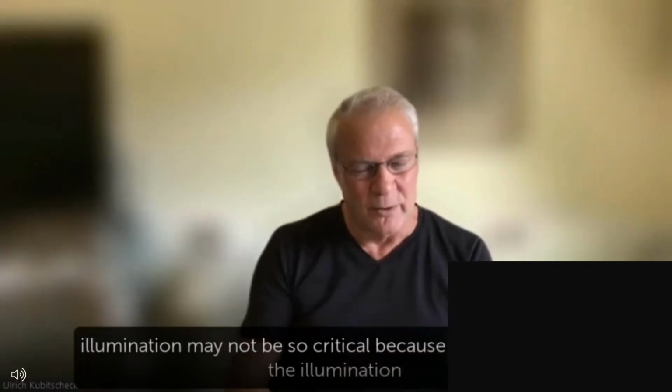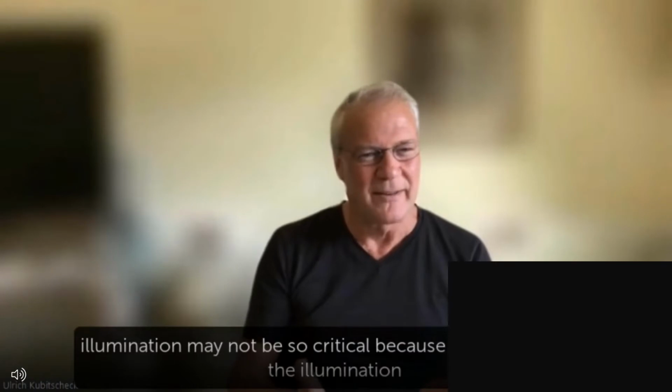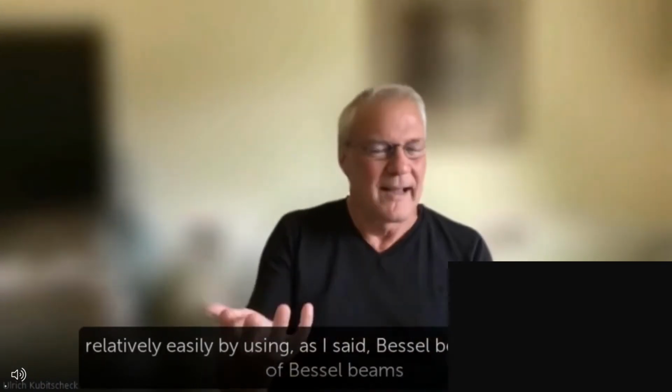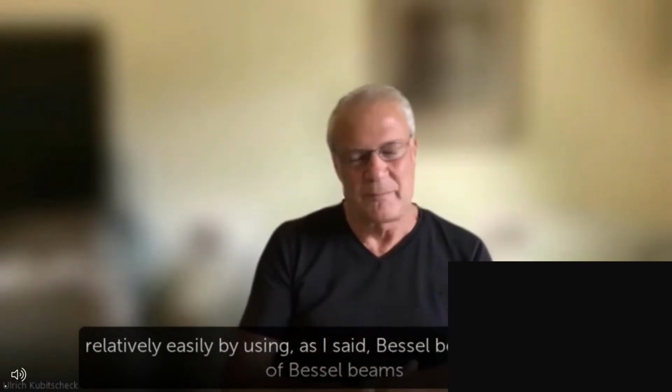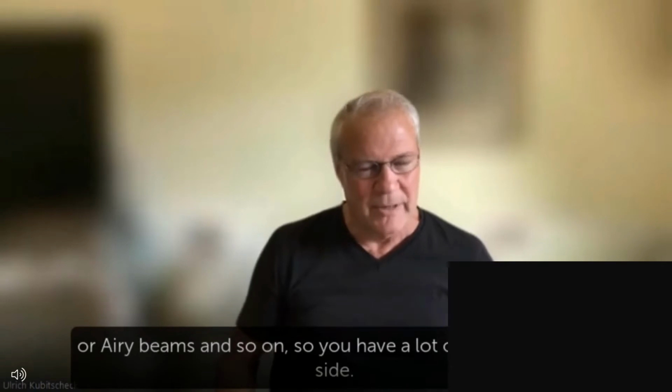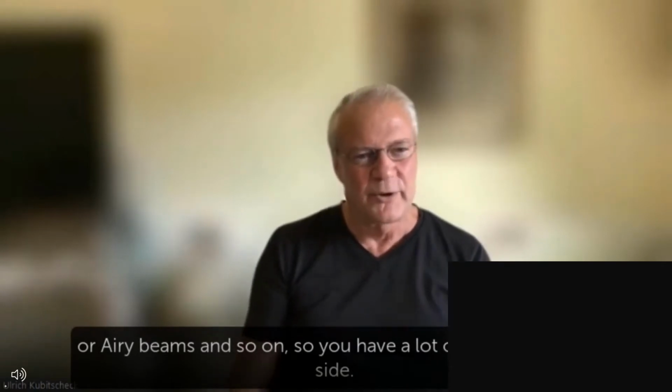Illumination may not be so critical because you can regulate the illumination relatively easily by using, as I said, Bessel beams or gratings of Bessel beams or Airy beams and so on. So you have a lot of options on that side.